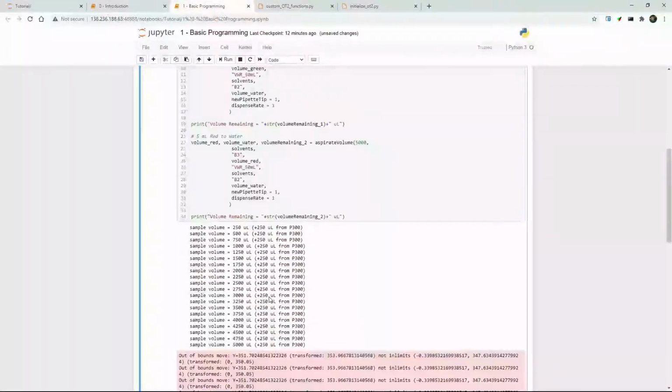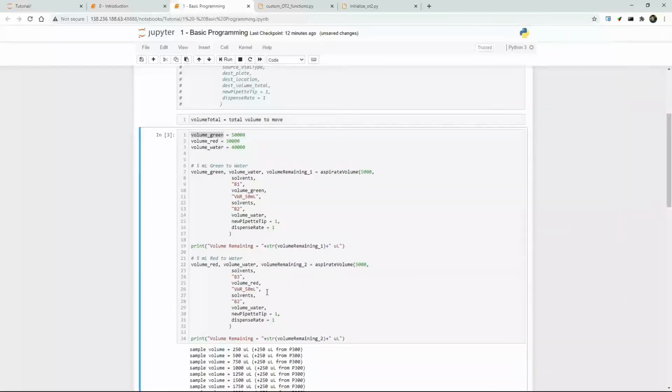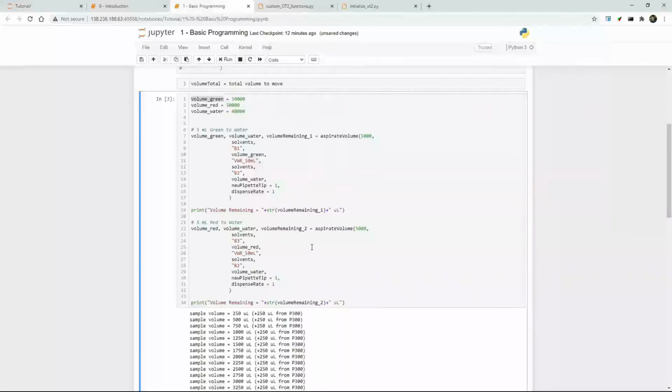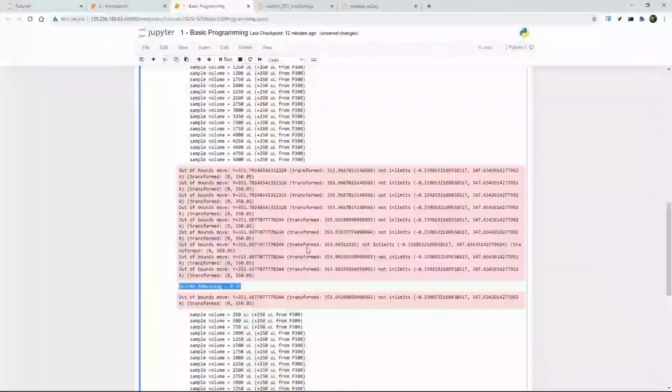But yeah, we just did our first liquid transfer. The robot's moving, everything's set up, everything's working exactly as it should be, and from here on out, the only way to go is up. I will say the learning curve is a little bit steep, but it's really nice having this code base that is already built and working, so you can just jump in and go right out of the bat without having to learn any Python or anything else. You're all ready to go.